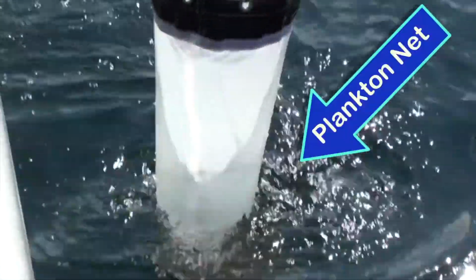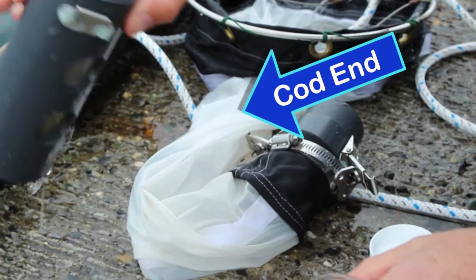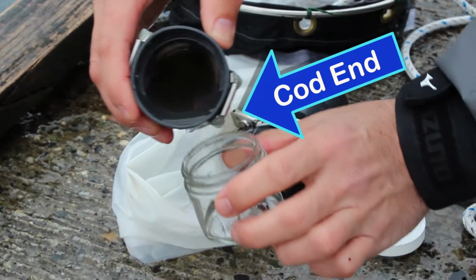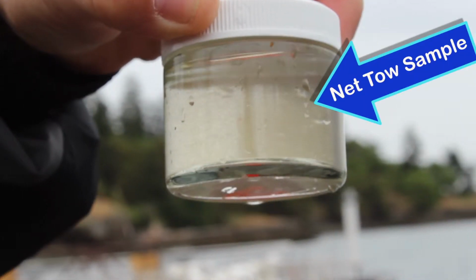Net tow samples are taken just below the water surface from a dock or a boat. By letting the net drag through the water, the phytoplankton are captured and concentrated into the net's cod end. This way, scientists end up with a sample of phytoplankton from many gallons of water, all condensed into a small jar.